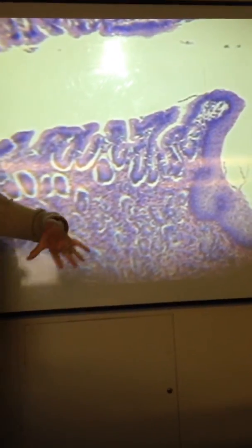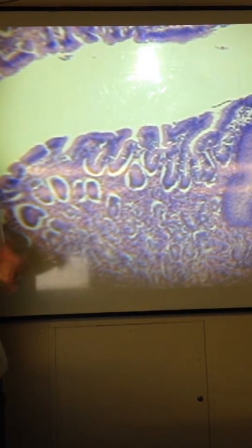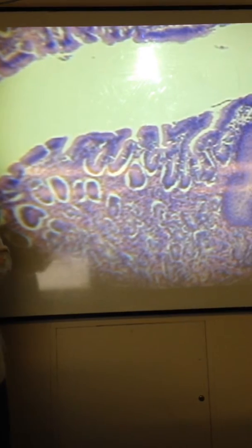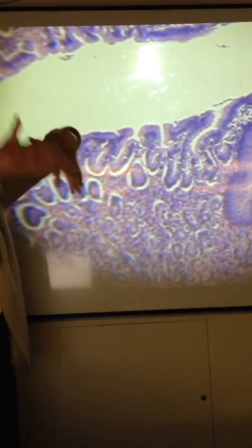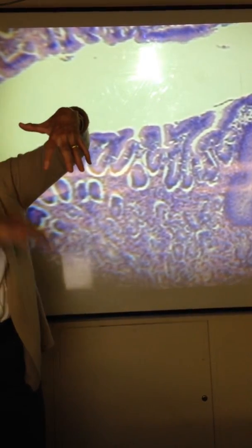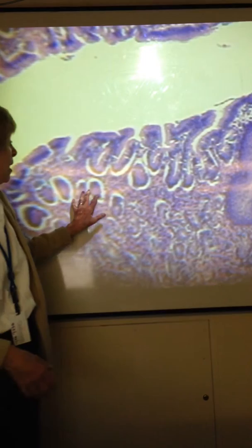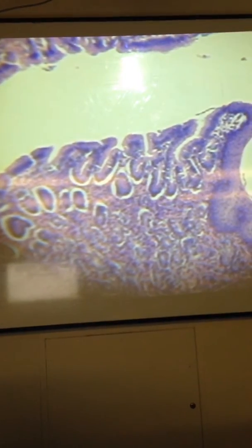And then somebody said, well, why don't you get that nice longitudinal cut? Well, this is a convoluted stomach. It might be on a rugae or something. So rather than nice longitudinal cuts of those gastric glands, you get a lot of oblique or cross sections, and then they just sort of look different from a nice longitudinal section. So let's go one more.